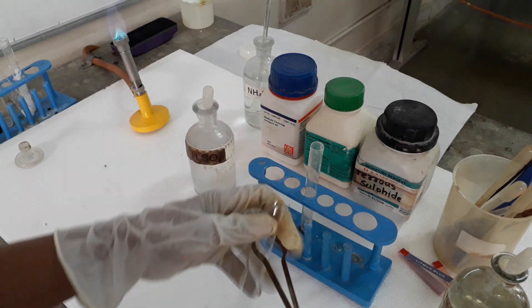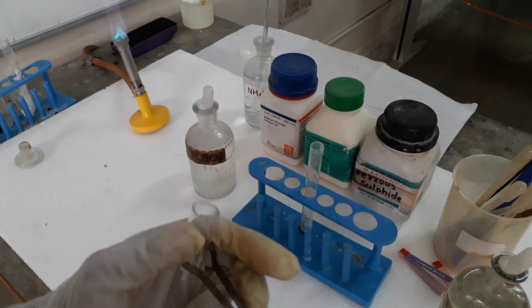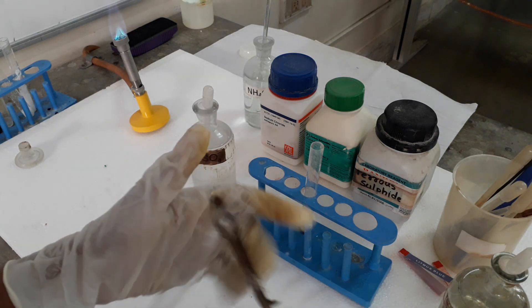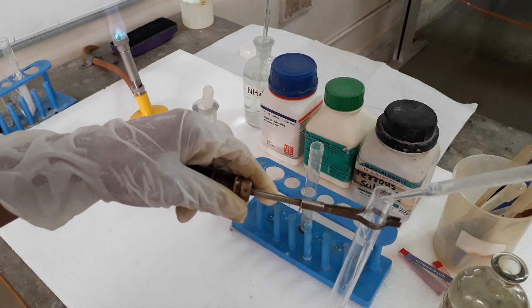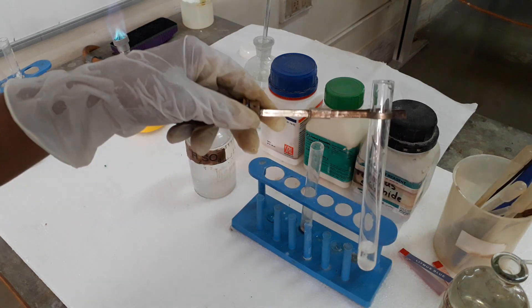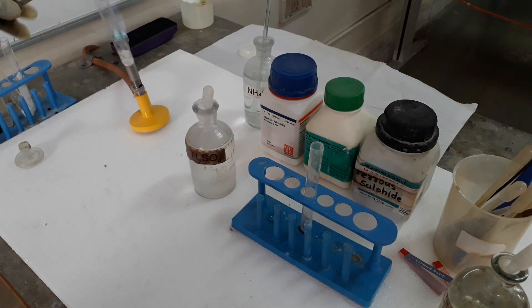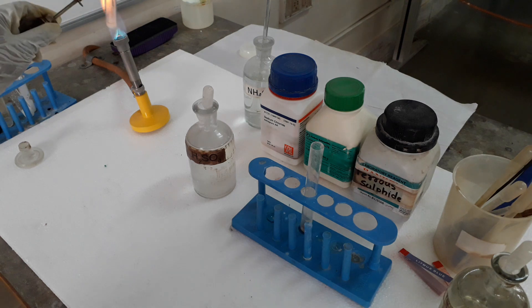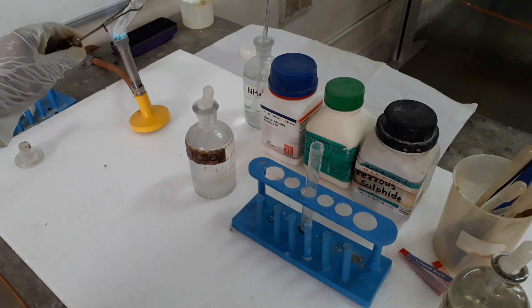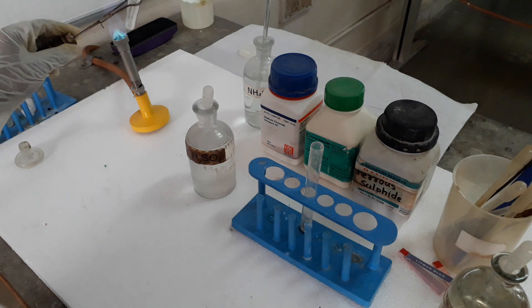Now the second one we are taking is sodium nitrate. For sodium nitrate, we have to add concentrated sulfuric acid and then heat it. When we heat it, we will see some brown fumes coming out from the test tube. Look at this.